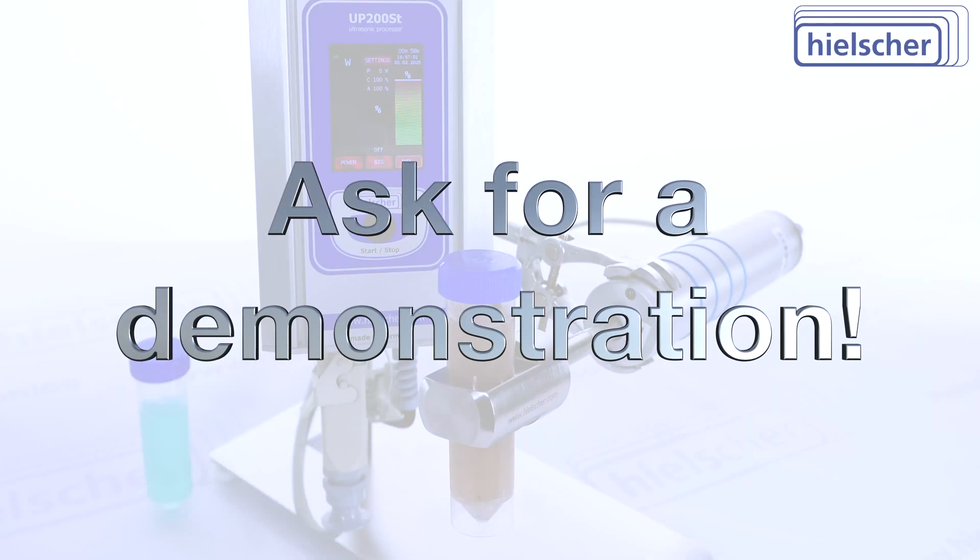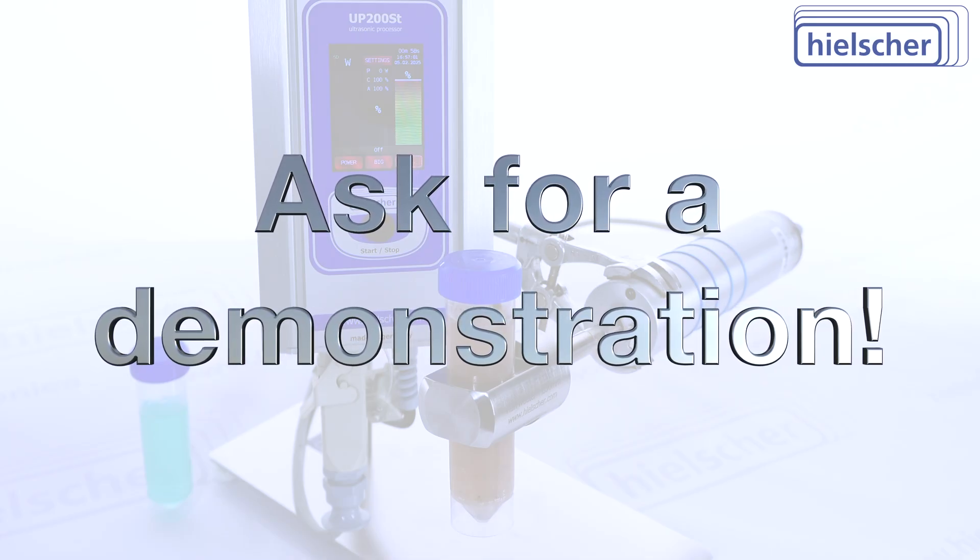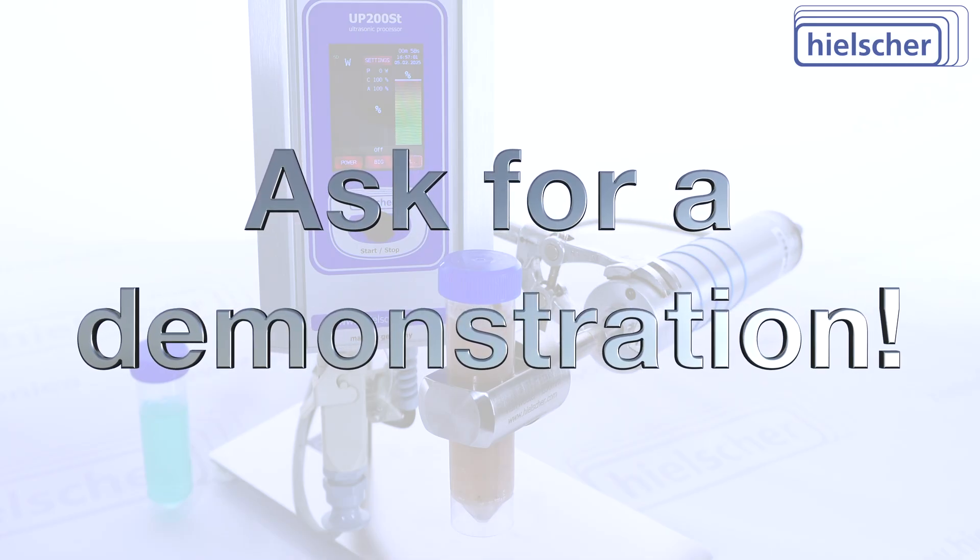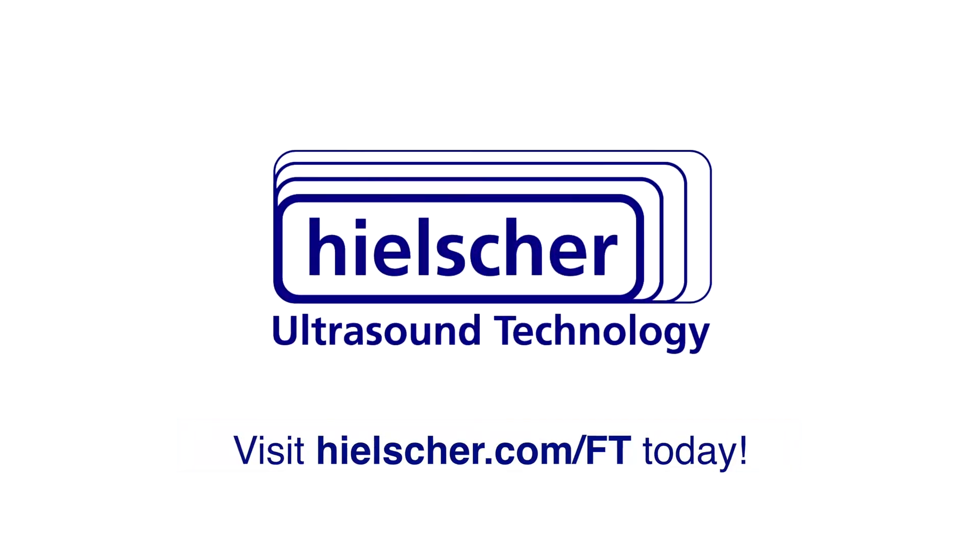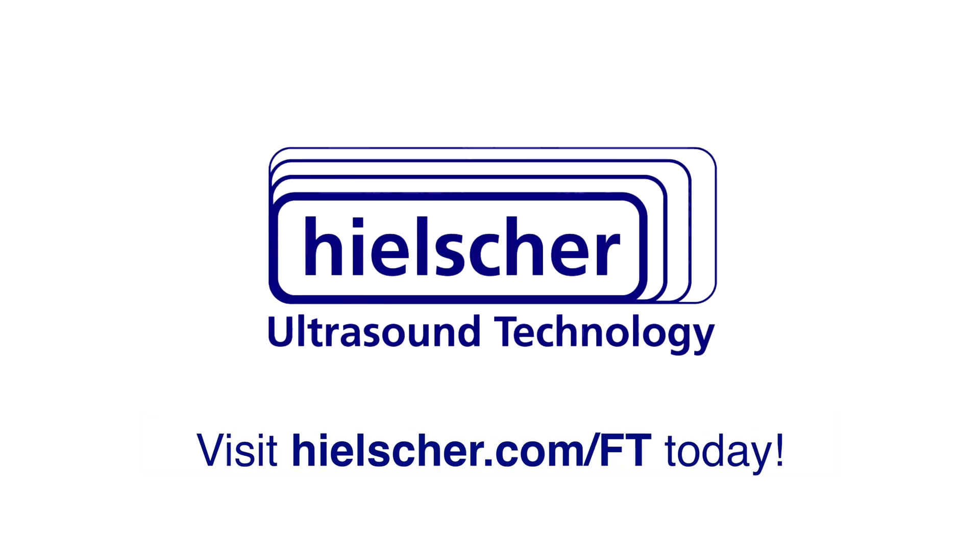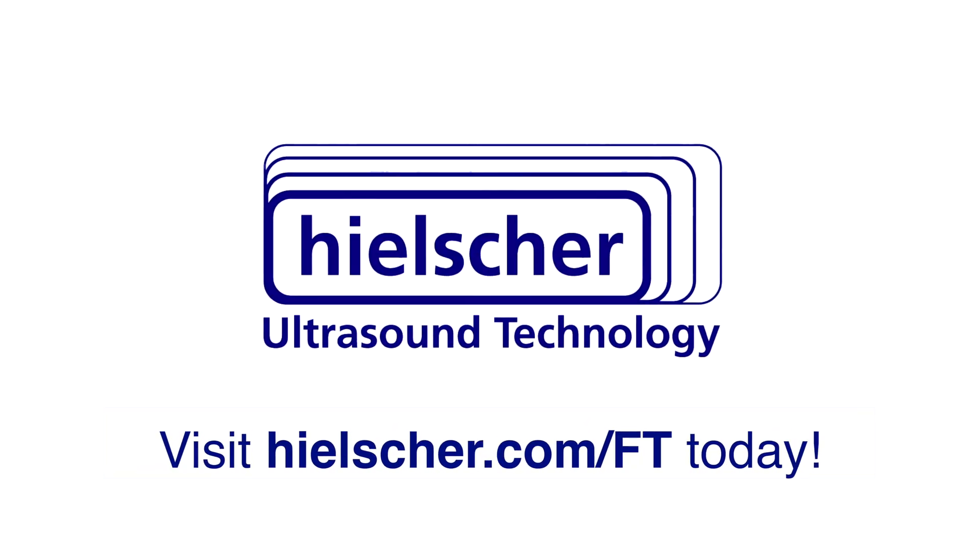Experience firsthand how the Vial Tweeter for 50-milliliter falcon tubes can accelerate your workflows, protect your samples, and bring higher efficiency to everything from routine cell disruption to advanced continuous flow reactions. For more information or to request a demonstration, contact Hielscher or visit hielscher.com/ft.